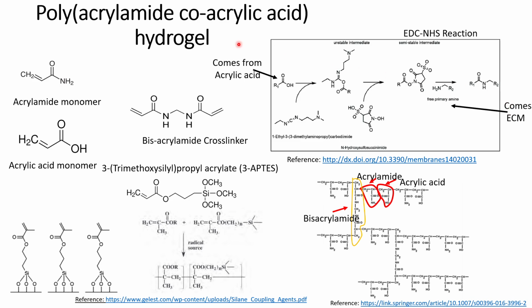So this is the method that is used to make polyacrylamide co-acrylic acid based hydrogels.